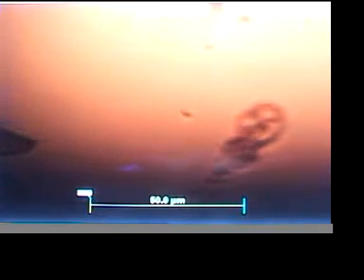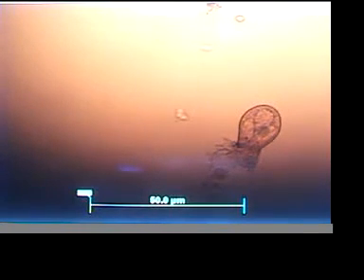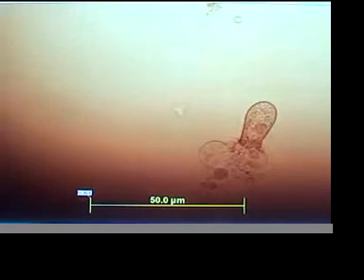Well, we get our first hit. It's going to be hard to get on the screen here. There he is. Because of the contrast is tough. Real time. Lighten it up a little there. There we go. Because of the grid and the grid slide, it's a little tough. And where is this happening? I'll tell you when he's done. 923 hertz plus 10,164 hertz.